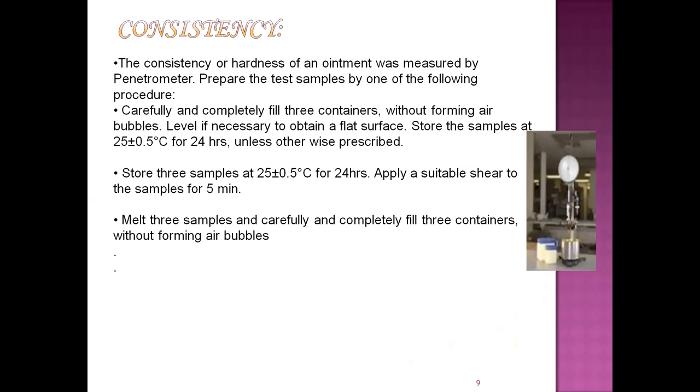Then the consistency of the ointment can be evaluated. It should also be evaluated apart from this. The consistency or hardness of an ointment is measured by the penetrometer. In this case, the figure shows the penetrometer.